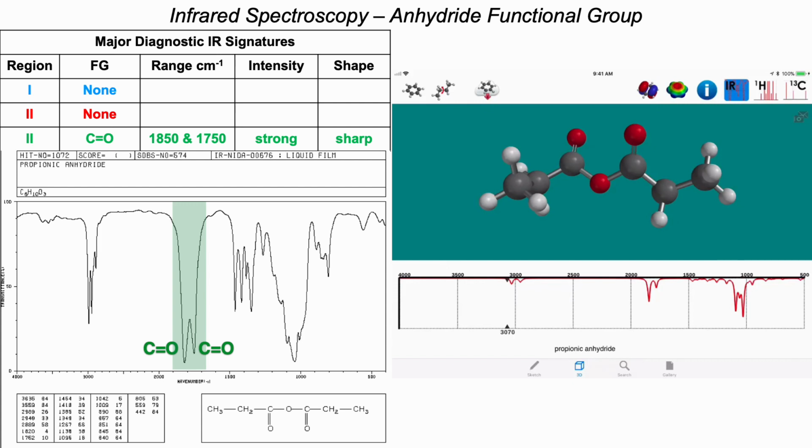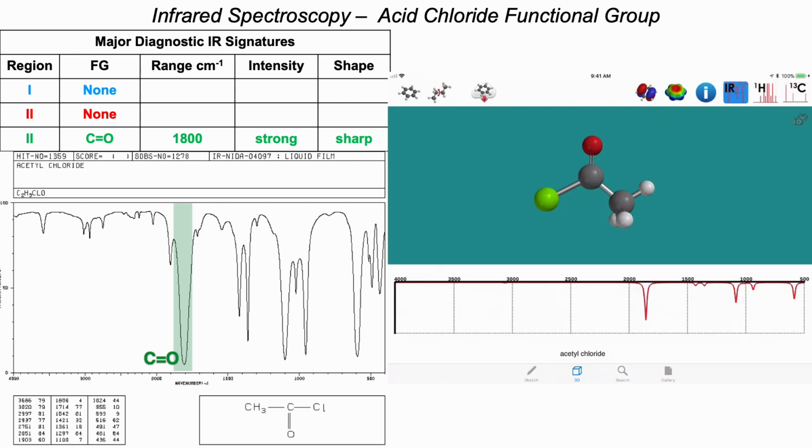And we'll move on now to the acid chloride functional group.